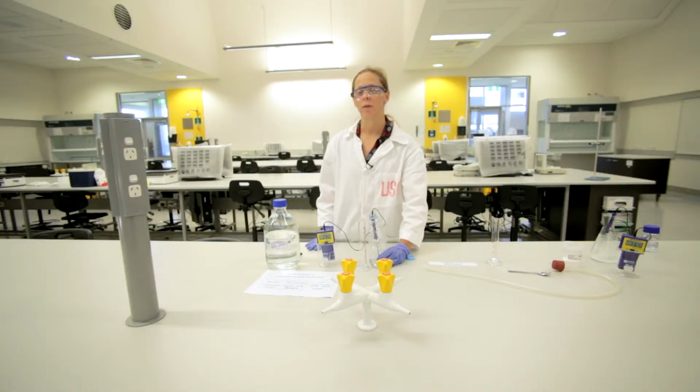So this time we've observed an increase in temperature, so it means that the reaction is releasing energy as it proceeds, so it's an exothermic reaction, which is the opposite of what we observed in our carbon dioxide production reaction.